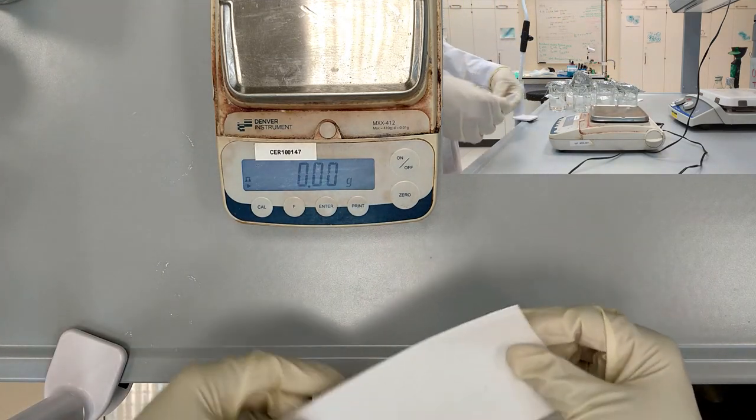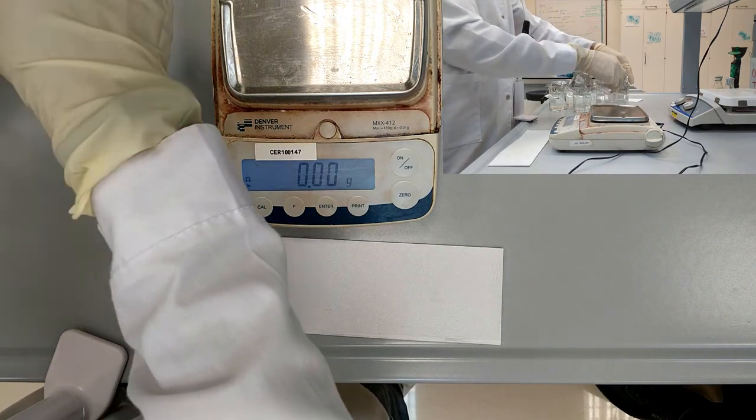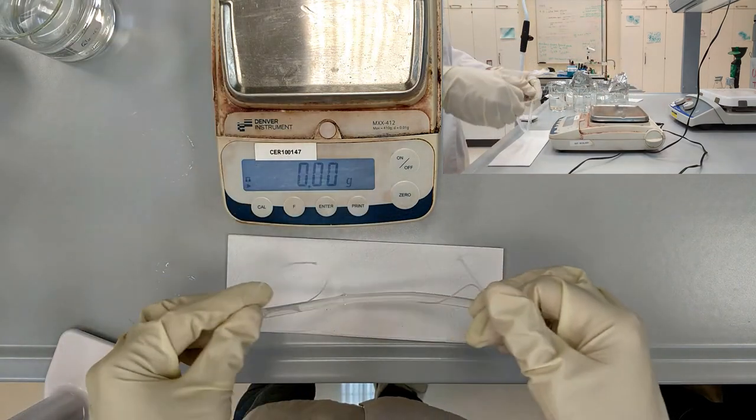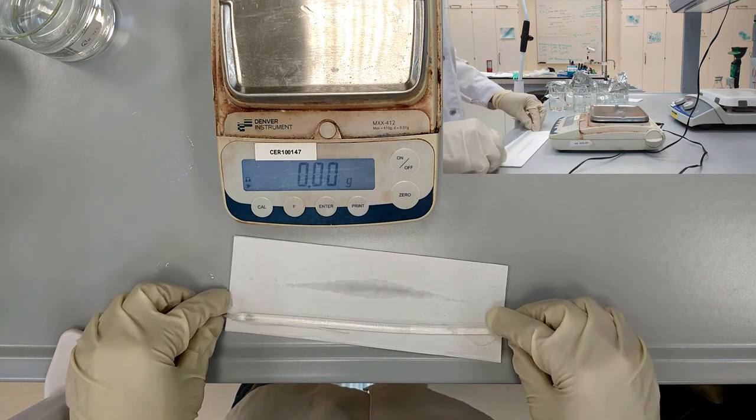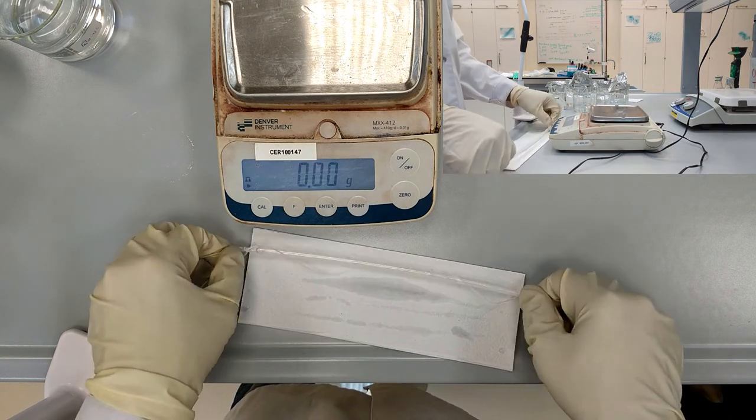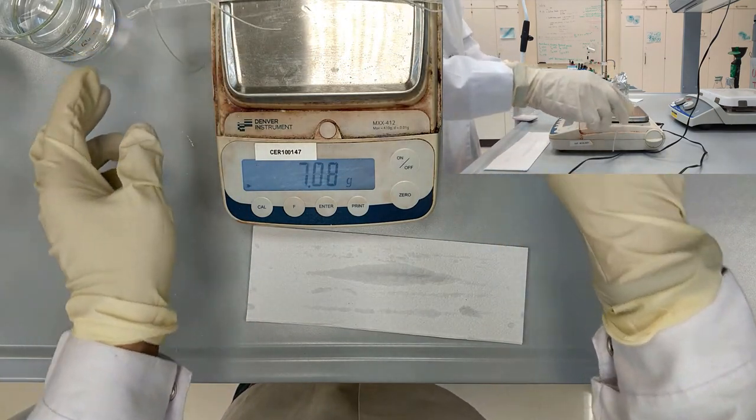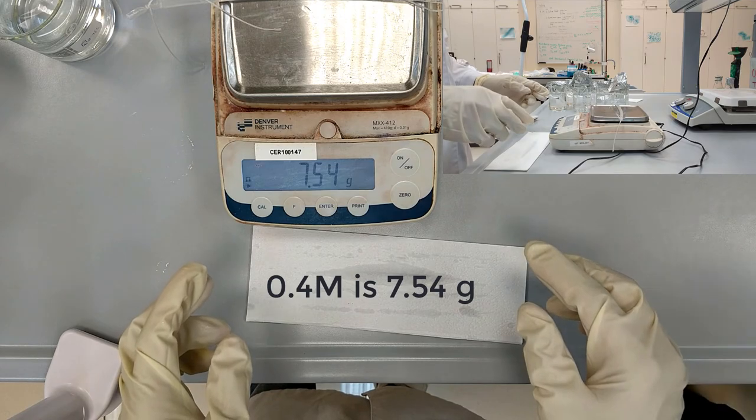Finally, we have the lowest concentration glucose solution in the tube. Its mass is 7.54 grams.